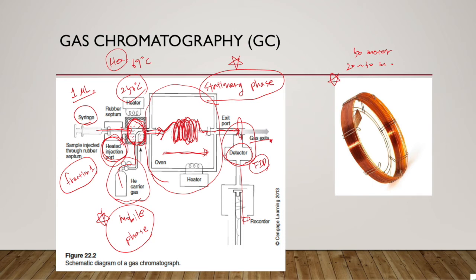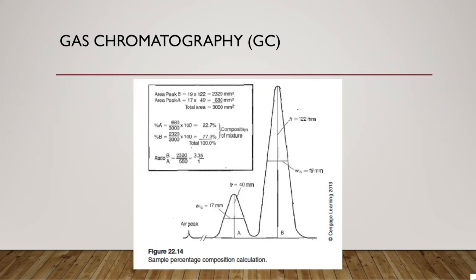Okay, so now let's take a look at chromatograms, the signals we can see on a computer.